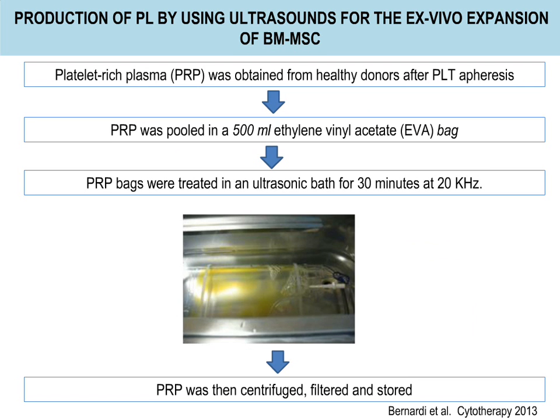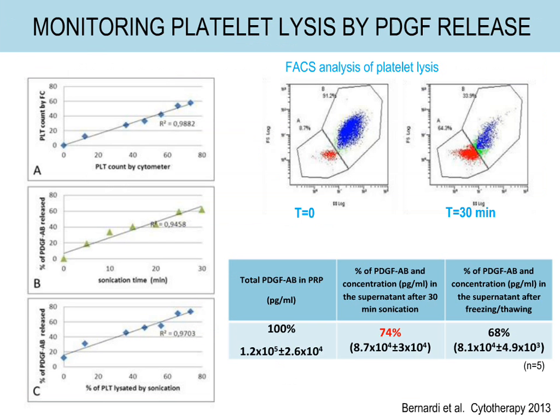About 20 donations are pooled together and subjected to ultrasonic treatment for 30 minutes at 20 kilohertz, and then the bags are centrifuged, the product is filtered and then stored at minus 80 degrees. We monitor platelet lysis by PDGF release.